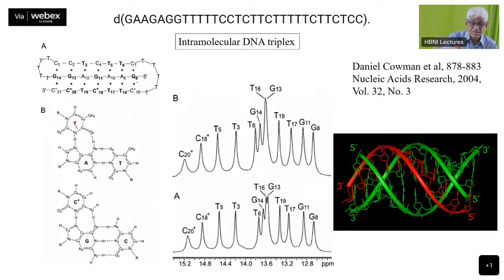They have used a particular funny labeling scheme here, the numbering scheme. They have 1, 2, 3, 4, 5, 6, 7. Then they have written here 8, 9, 10, 11, 12. This is not necessarily going along the 5' to 3' sequence. They just label it from the point of view of analyzing here.